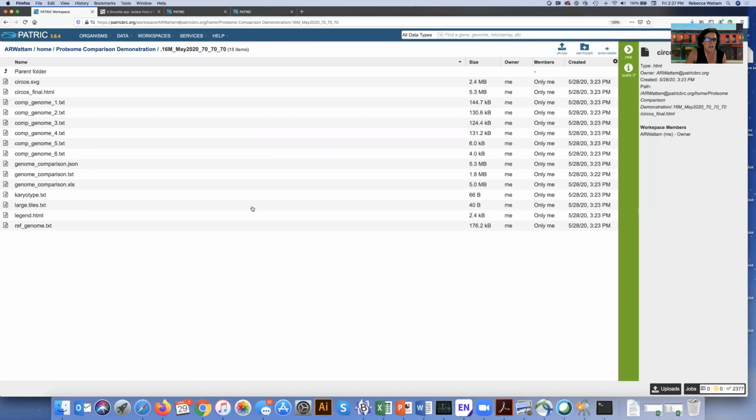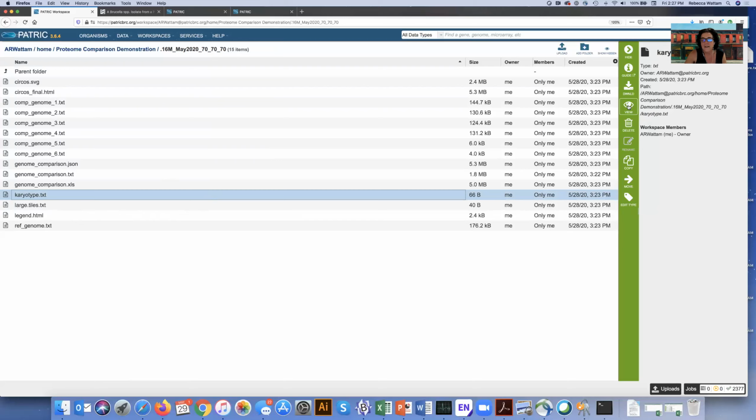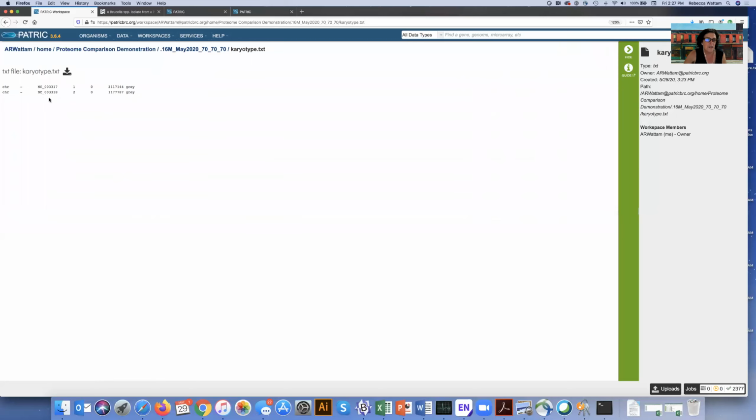There are a couple of other text documents in here. The karyotype, the large tiles, the legend, well, we can quickly look at that. The karyotype is just talking about the 2 large chromosomes in Brucella melitensis.